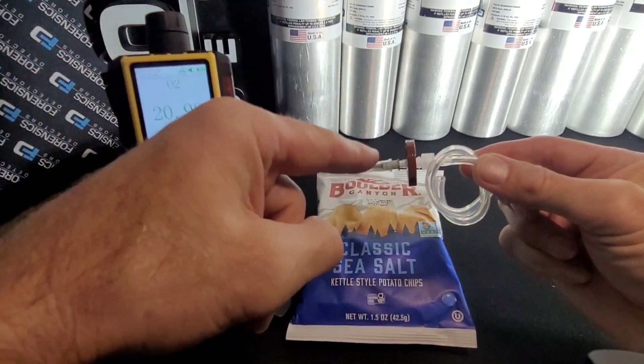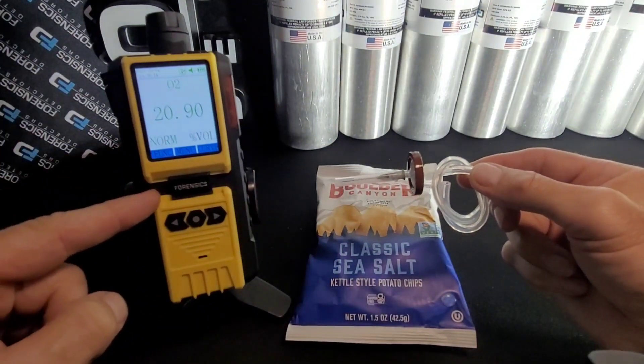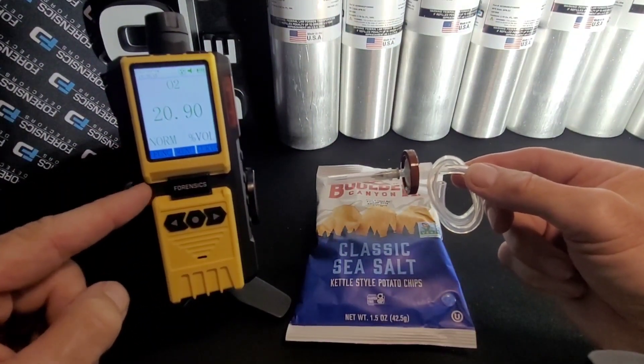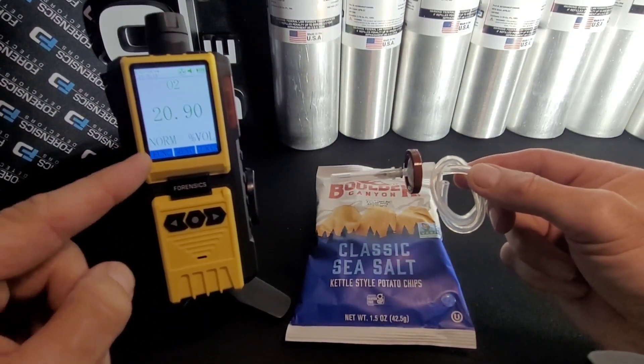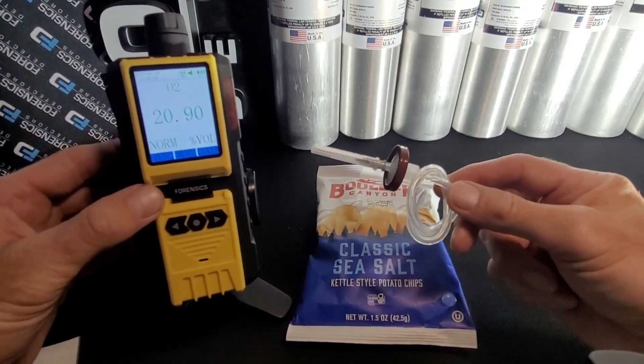Grab your needle — it comes with the filter and the tubing. Before we start, make sure your unit has been calibrated within the past 6 to 12 months. Very important. Make sure it's reading 20.9 in the fresh air in your room — it should be reading 20.9.